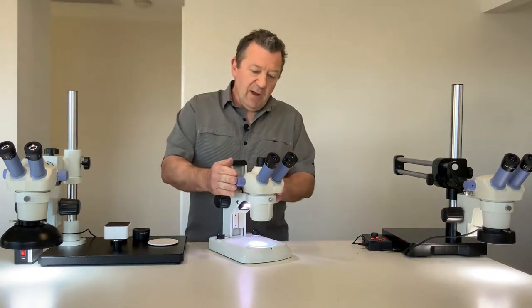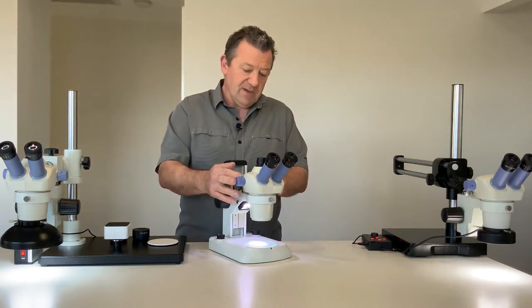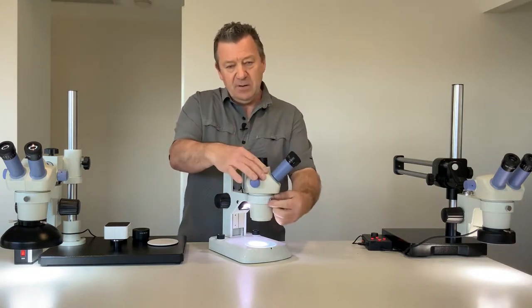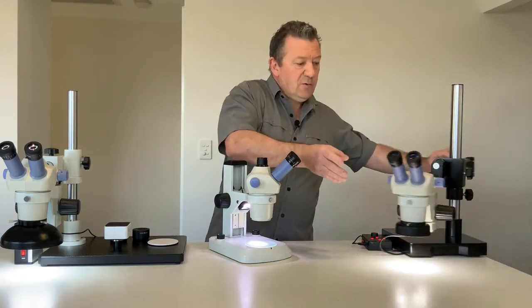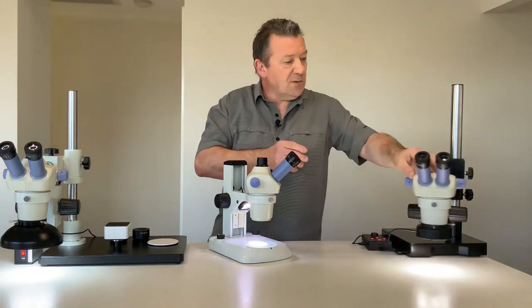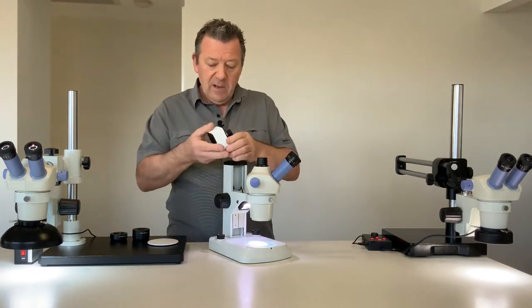We have these available in a trinocular configuration and binocular configuration. This is a trinocular — with the trinocular head you can fit a digital microscope camera. This one, for example, is your binocular configuration, but if you do want to buy a digital camera we recommend you opt for the trinocular.